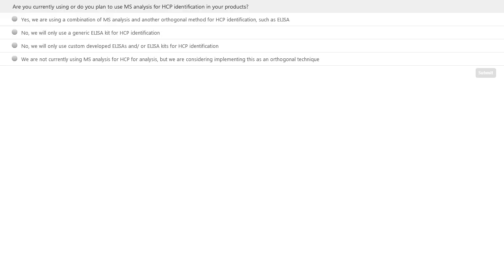And I think it's time now for a poll question, so I'll hand over to Eliza. Thank you so much. Okay, everybody, so it is now time for the first polling question of today, and the question is, are you currently using or do you plan to use MS analysis for HCP identification in your products? And the options that we have today are, yes, we are using a combination of MS analysis and another orthogonal method for HCP identification, such as ELISA. We also have the option, no, we will only use a generic ELISA kit for HCP identification.